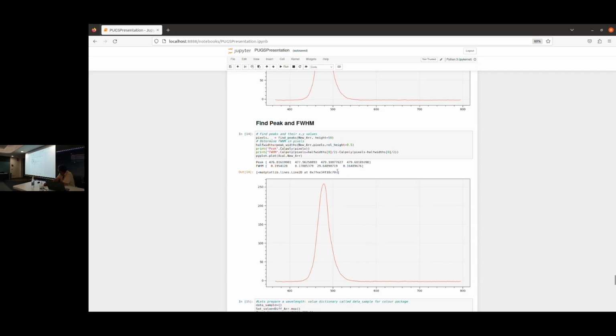I think there's some junk that you have to reject. So this has a 479 nanometer peak over here with a 30 nanometer width at half maximum. So it's about 29 point something, 30 nanometer band, which is about right. I mean, you look at the data sheet of these LEDs, these are the numbers you will find.